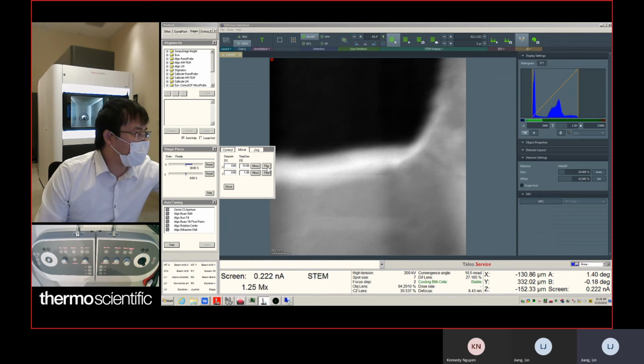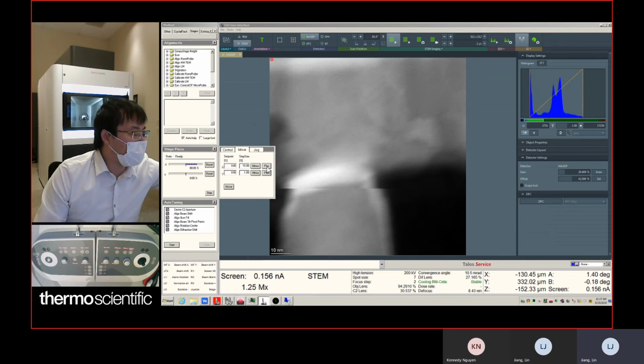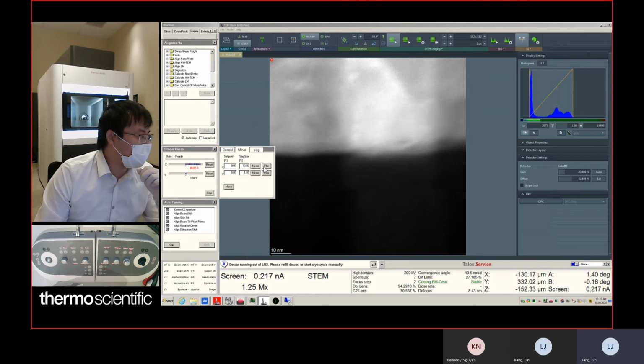This is to show you the range, how much you move according to the max range. The maximum range is 100%. When you reach 100%, you cannot move with the piezo stage anymore. Let's reach the limit. You see, when you reach 88% it becomes red.